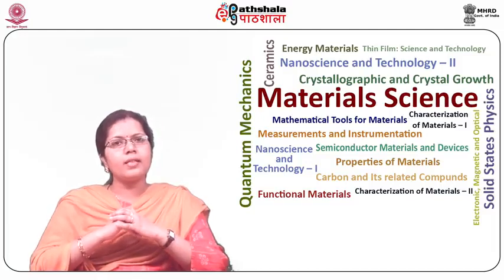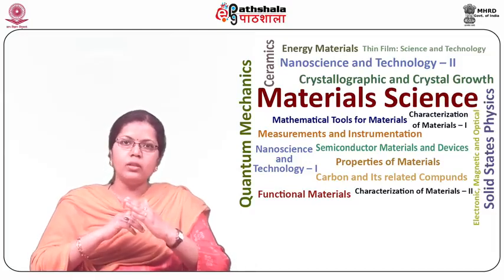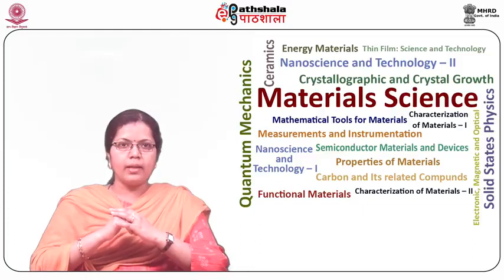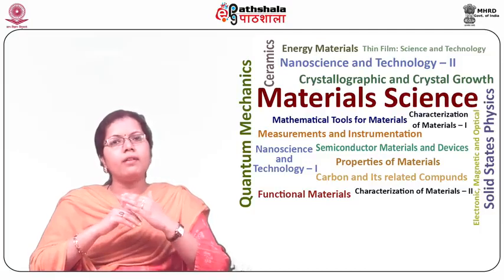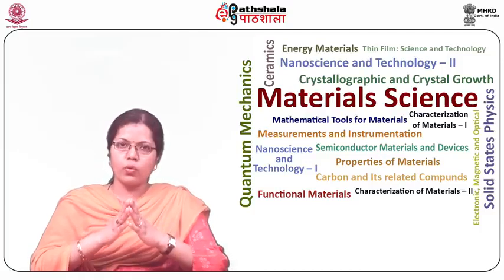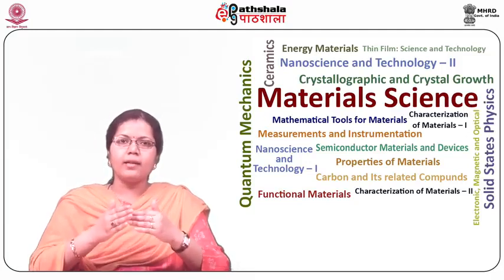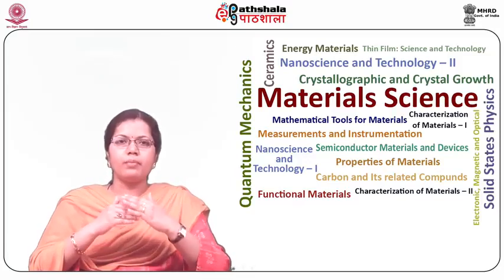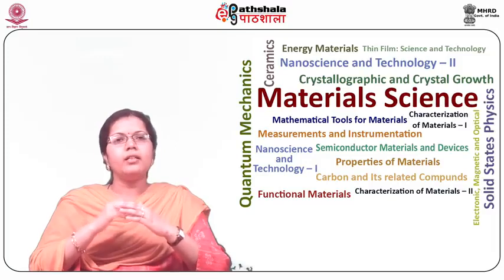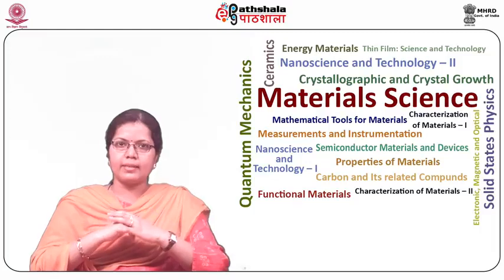But things as small as a virus or single proteins are not visible through the microscope, thereby limiting the utility of this device. In this chapter, we will learn about the fundamentals of optical microscopy, including its working principle, image formation, and adjusting the microscope suitably to make use of its complete potential. Additionally, different optical imaging techniques have also been discussed.